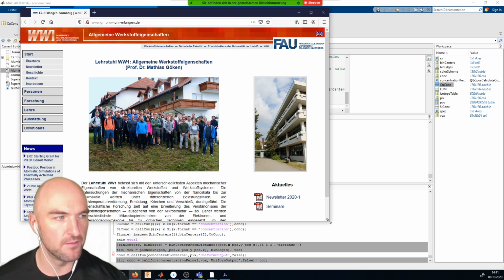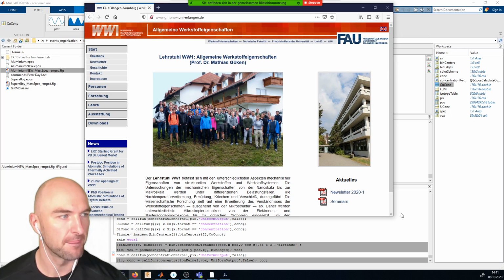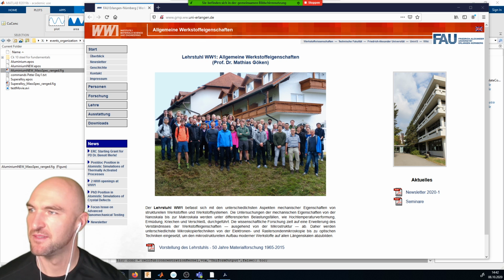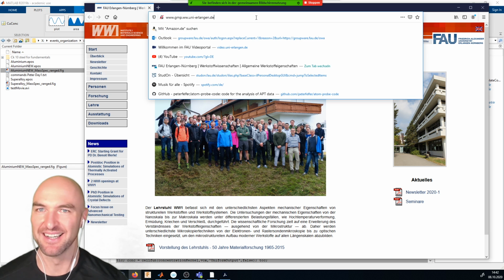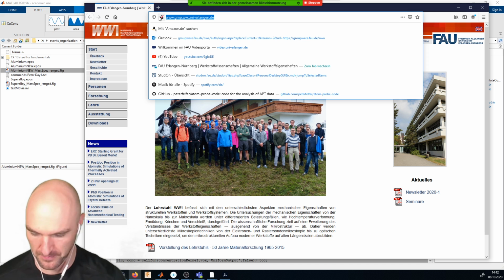So who of you has never heard about an isosurface? Anyone? Raise your hand. Everyone's heard about an isosurface. Okay. So, thank you, Martina.